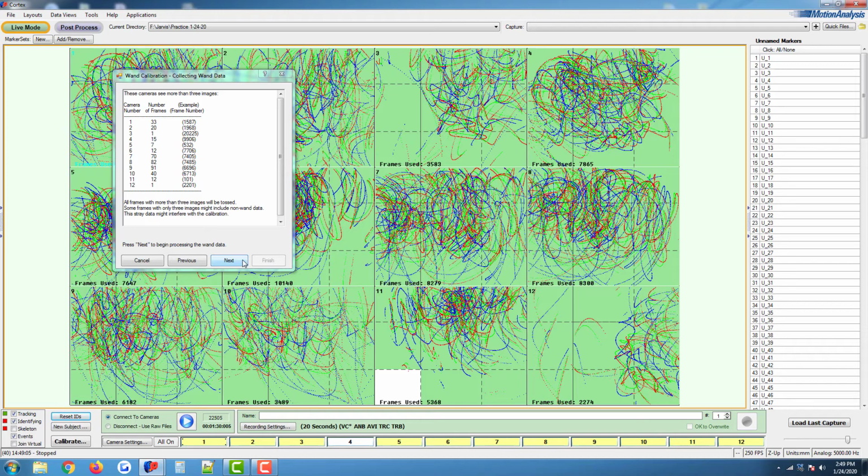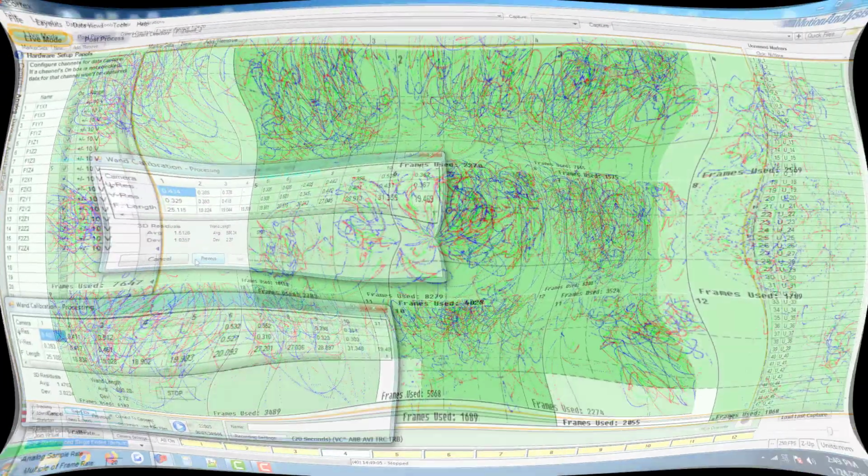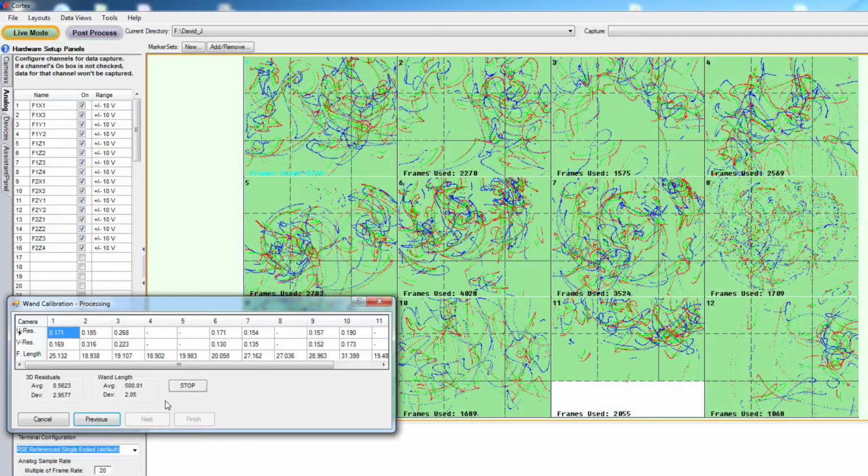But if it's more, like in this case, we would ideally click previous, but for the sake of this video, I'm just gonna click next. After the computer does the calculations, we're gonna take a look at our results.